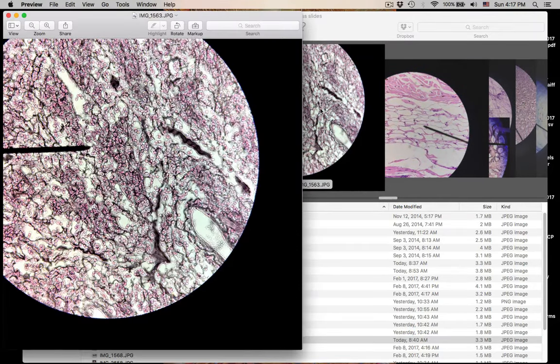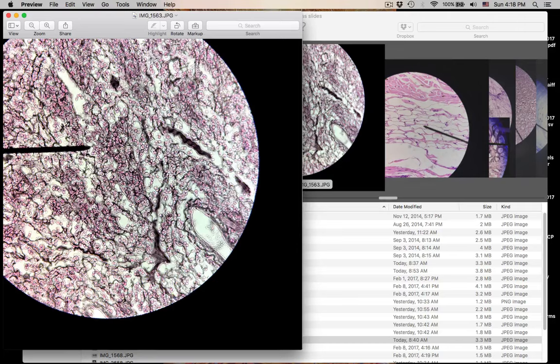Number seventeen is reticular connective tissue. These black-stained protein fibers are reticular protein fibers. Where do you find them? Soft organs — they supply the supporting framework for soft organs like the spleen and liver. Almost all the cells you see here are from the organ they are supporting. There are also fibroblasts making these reticular fibers, but you cannot see them because there are so many cells of the organ they're supporting.